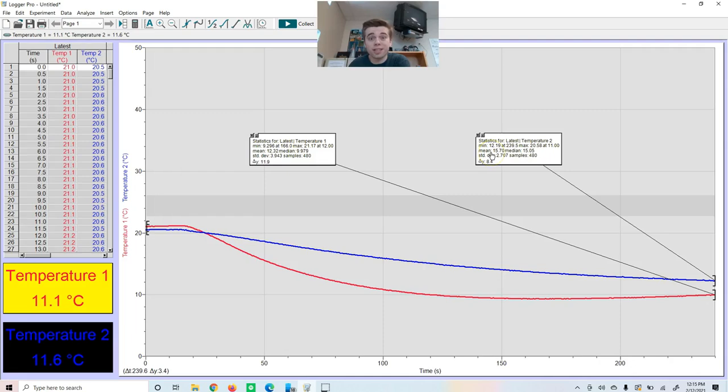So I'm going to pause this video now. You can go ahead and calculate that temperature difference and make sure you can figure out what the molar mass of each of these molecules is and whether or not they have hydrogen bonding. And then we will start our second trial.